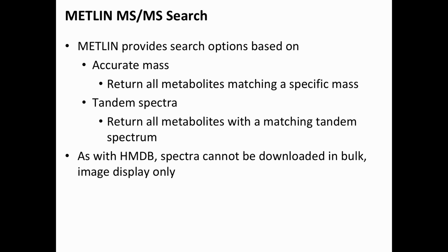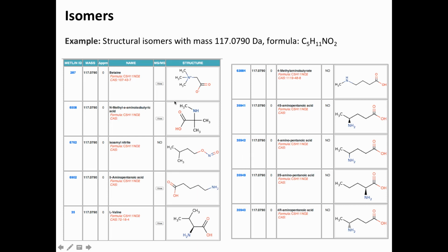But again, when you look at these structures, it is not implausible that structures that are very similar, like those two guys here, have the same composition, but you would argue their retention time is not going to be vastly different. They're chemically very similar. You might exclude some of these structures, but not the majority of them.